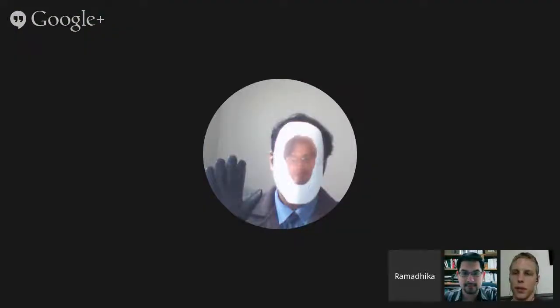Let's see. Okay, so I appreciate... do y'all know each other first of all? Eli and Danny. Yes. Okay. Do y'all work in the same lab? Okay. Yeah. So I appreciate your email, Eli, telling me what you wanted to learn. I think I'll just start at the very beginning, and then we'll zoom in where we need more focus, and zoom out where we.